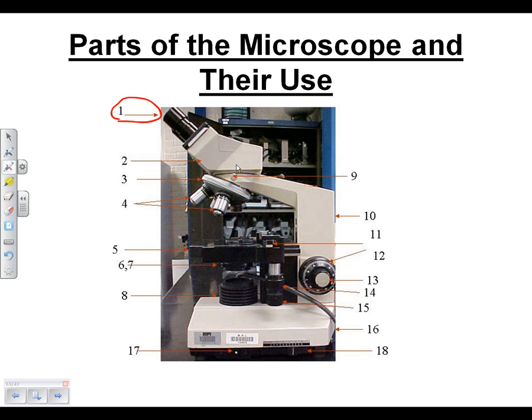The other thing you'll see is that there'll be a head on the microscope, and that head can turn in both directions. This is the most common way to have it pointed this way. That way you don't smash your nose down here onto the arm of the microscope, and there's a little knob on the microscope that will allow you to loosen or tighten it so you can spin this around. You definitely will see the objective lenses on the turret, and I'll show you some details about that in a minute. There'll be an arm that holds the whole microscope.